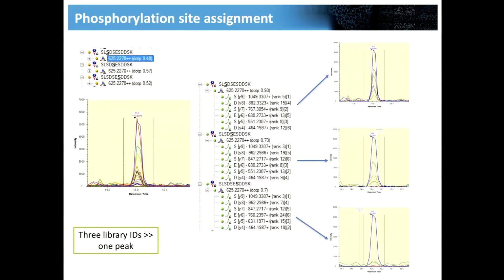But in this case, we can, of course, extract as many ions as we want, and we can also look at combinations of ions. For example, here I extracted the whole series, basically from here, 9, 8, 7, 6, 5, 4, and between these 9, 8, 7, 6, 5, 4, I can then try and look how much evidence I have for each localization.